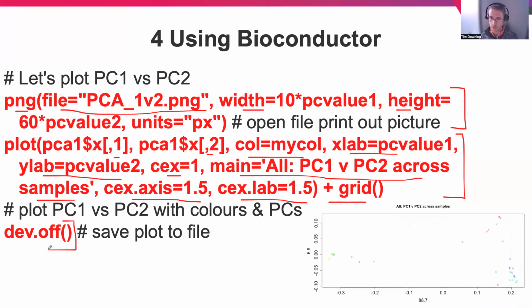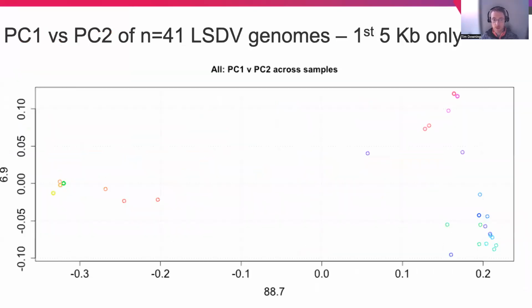So if we plot this out, we'll get a principal components analysis plot looking like this. You can see the colors and the points, the fraction of variation explained on each axis. You can see there PC1 explains a very, very large fraction of the total variation. So honestly, PC2 is not really worth looking at because most of it's on PC1. If you zoom in, you see something like this. So you can see across PC1, there's definitely a difference between some samples compared to other samples. And PC2, yeah, there's some samples that differentiate on that axis as well.